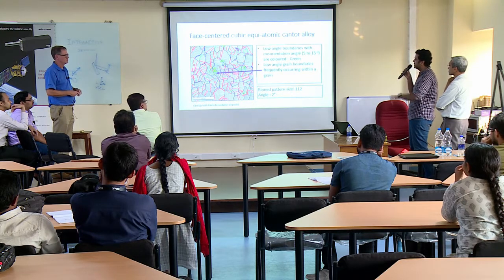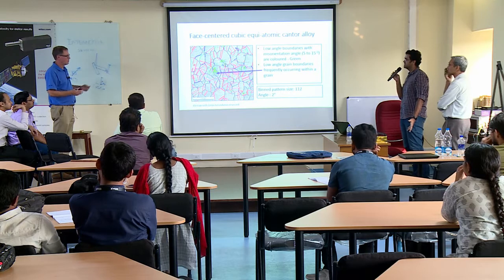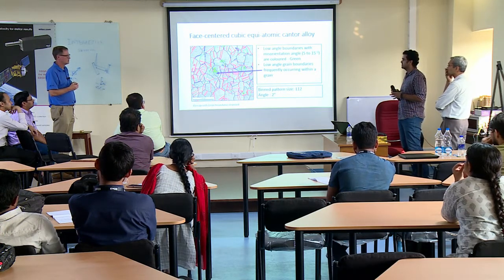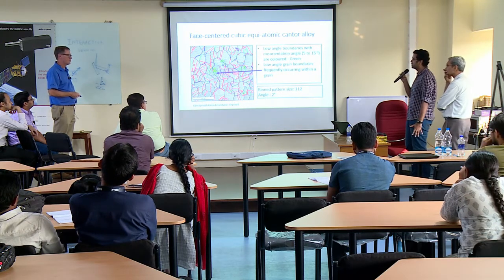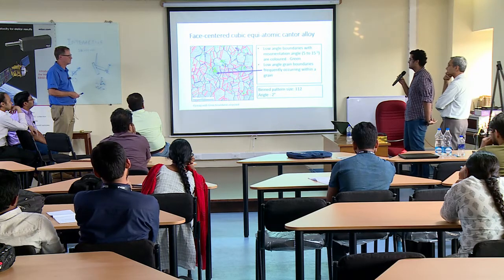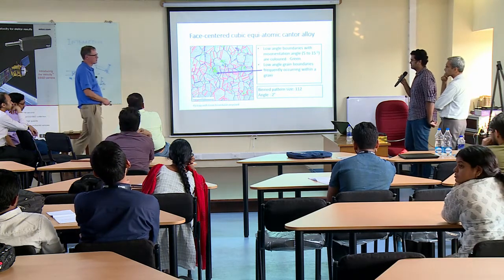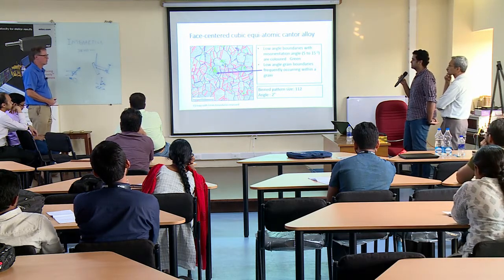In certain cases, we also find a high angle grain boundary, like greater than 15 degrees. Yeah, I don't know what would cause that. That has to be a misindexing of some kind. But that's also localized, found in few grains and not others. That's strange. Yeah, I don't know why that would be. What I would recommend is save the patterns for something like this, and then we can have a chance at trying to figure out what the problem might be.